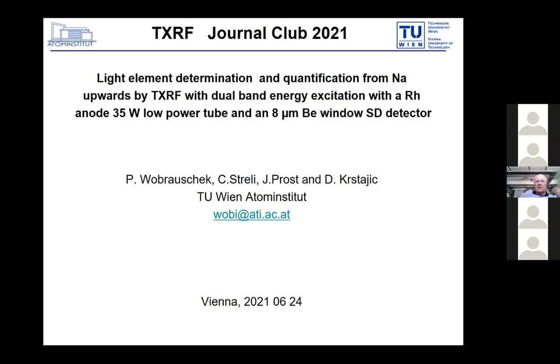As you can see from the rather lengthy title, we are talking basically about light elements, determination and quantification by TXRF in a special mode of excitation, namely having the chance to use for the light elements the lower energies emitted from the rhodium tube, which are the rhodium L lines, and for the rest the reflex at the rhodium K line, which is perfectly suited for the excitation of all the rest above the light elements, and which is, of course, interesting.